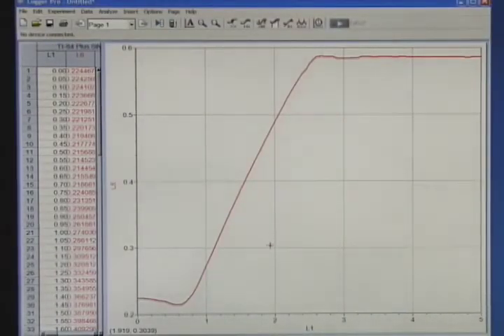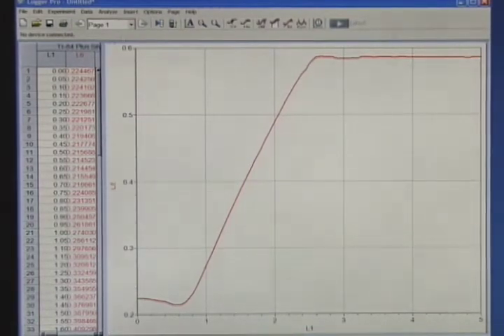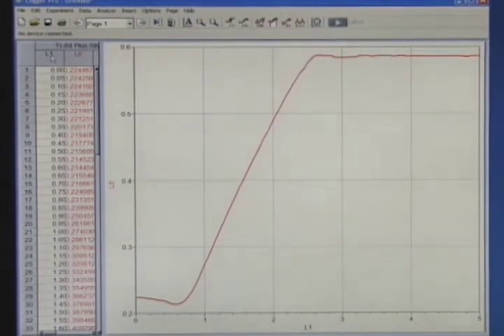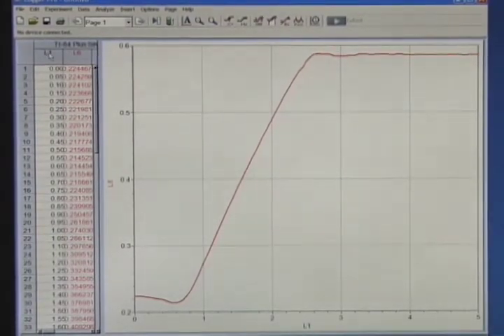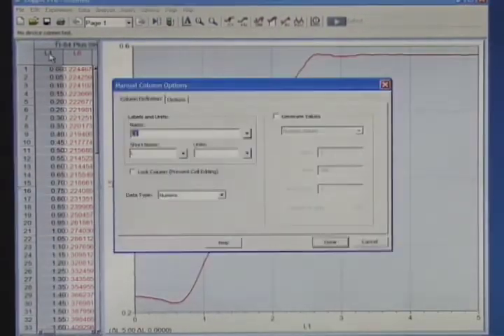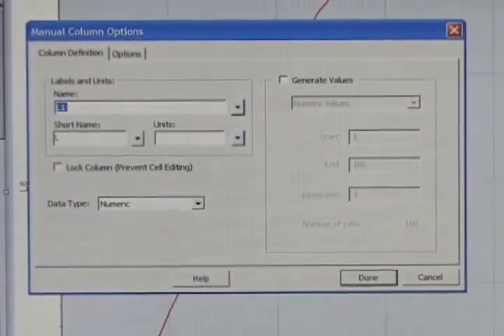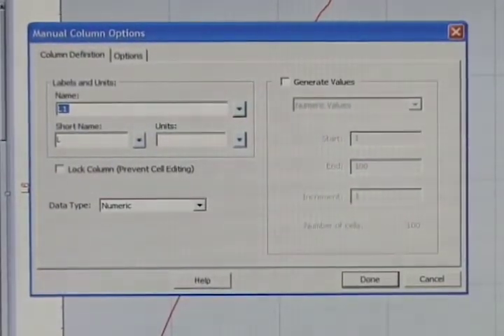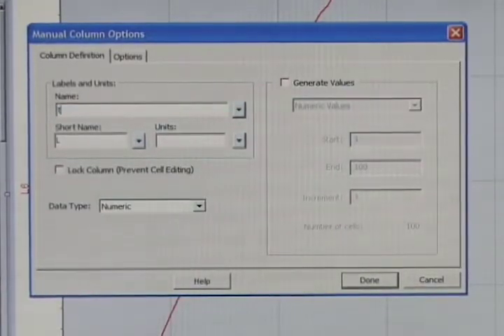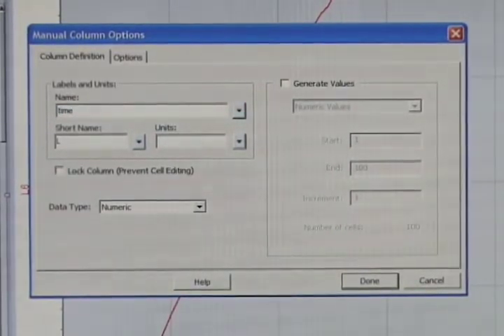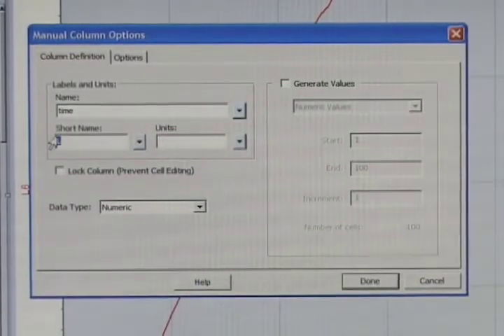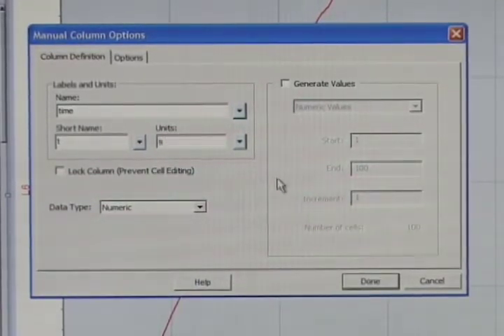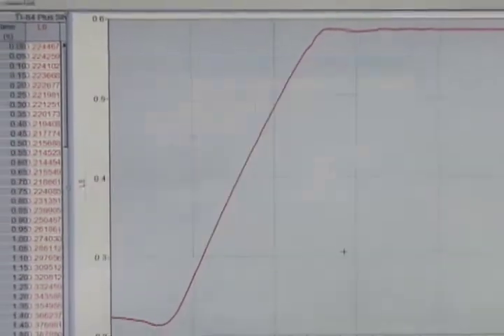The data comes in with names that it had in the calculator. The first list, List 1, is actually time. In the data table, I'll double-click on L1. It brings up a dialog box. I will change the name from L1 to Time, the short name to T, and the units to S for seconds. Then I choose Done.